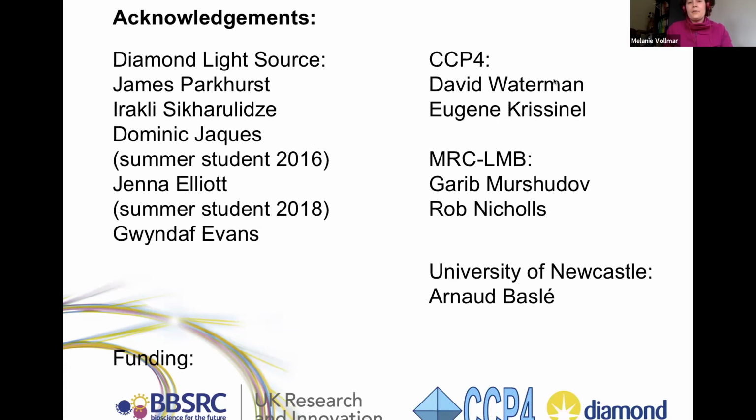David and Eugene are from CCP4. So CCP4 is a crystallographic software suite that holds a vast number of MX software projects under an umbrella. And most crystallographers in their life will have used one of the programs or another. And so we are aiming for having some machine learning projects and tools included in the suite in the longer run. Also CCP4 pays half of my salary.